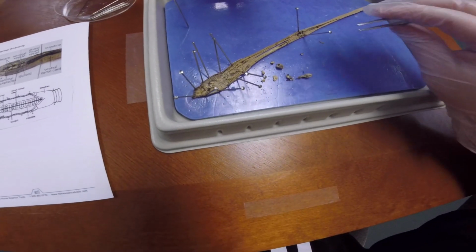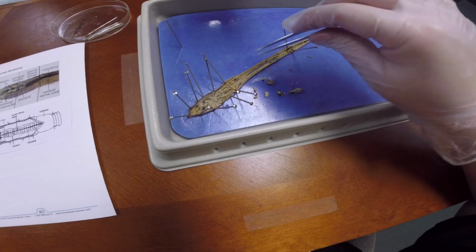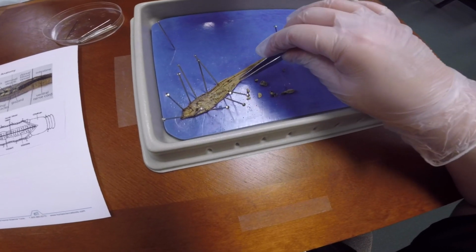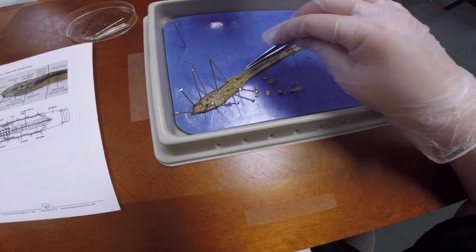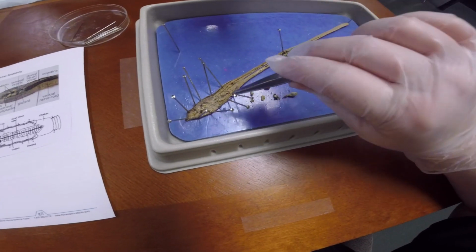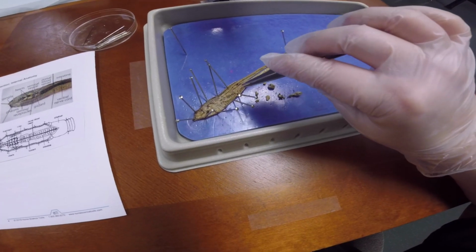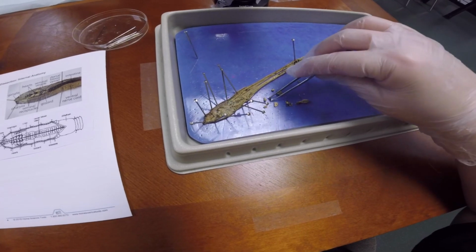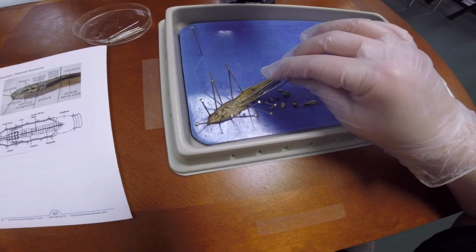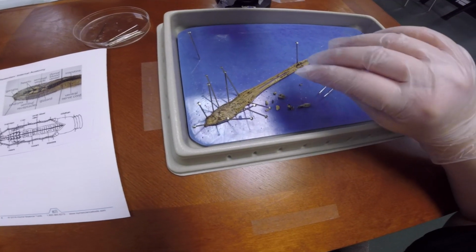Okay, so as you can see, there's not really much to it when you open it up. Once you get down here, most of the complicated parts are from the clitellum up, so that's where most of the action goes on. So these guys are very beneficial to us, but they're also very simple organisms. So you've kind of seen all that there is to see on this guy, and that's the end of our earthworm dissection show.